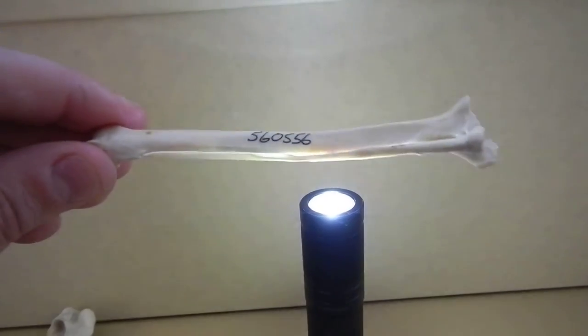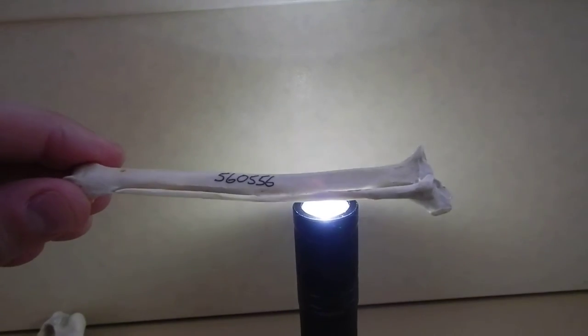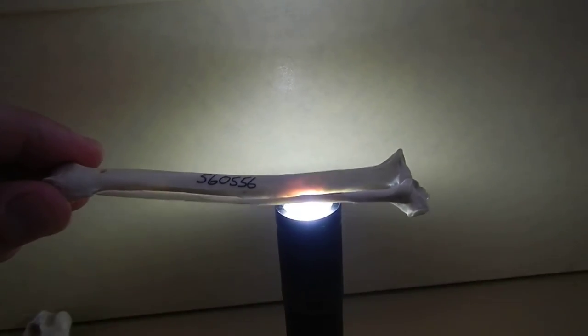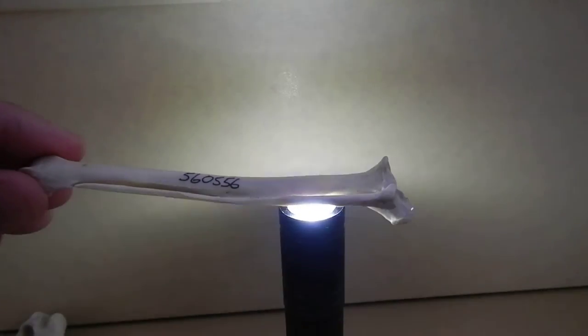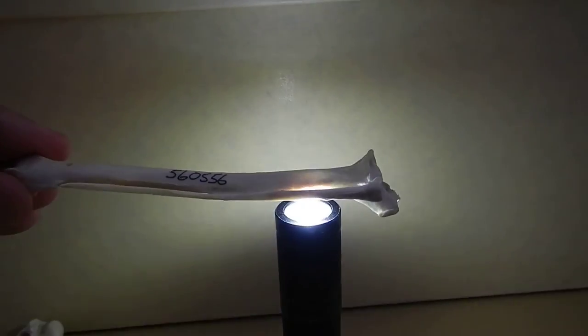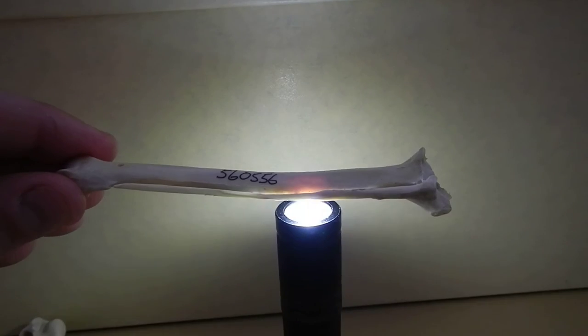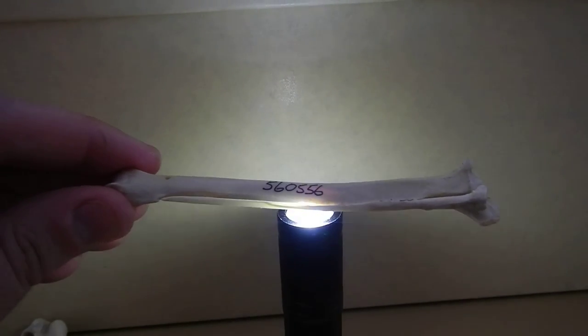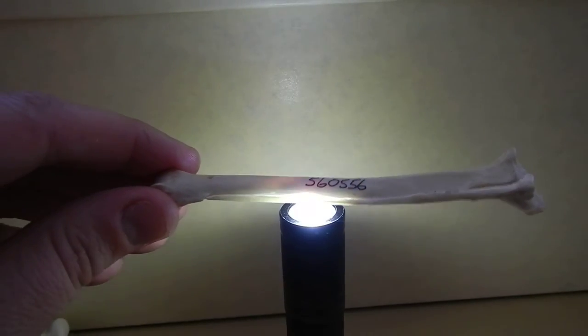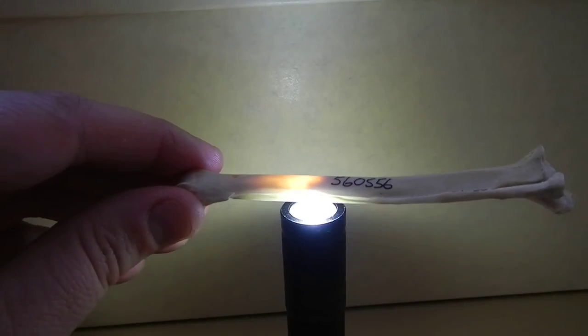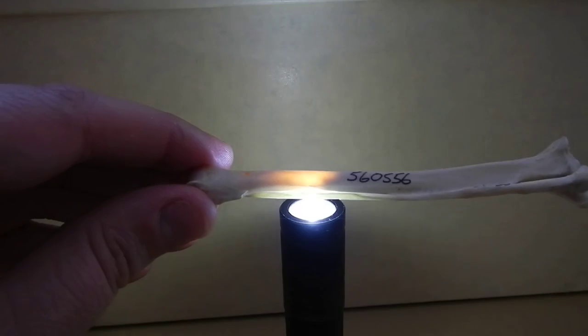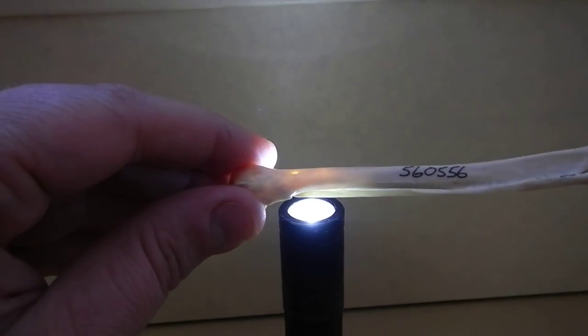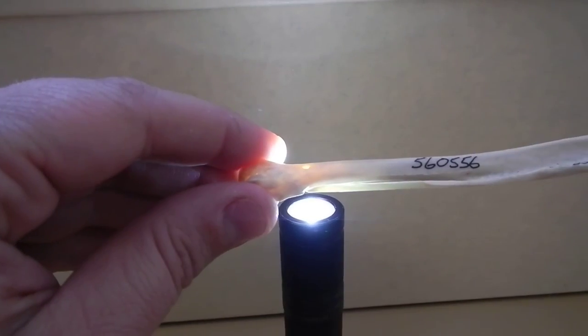In bones where medullary bone partially fills the element, like this tibiotarsus, you can see that it's not glowing like the humerus. It's pretty opaque. And then you get down to the end and you can tell when you hit the extent of the medullary bone because the bone starts glowing again.